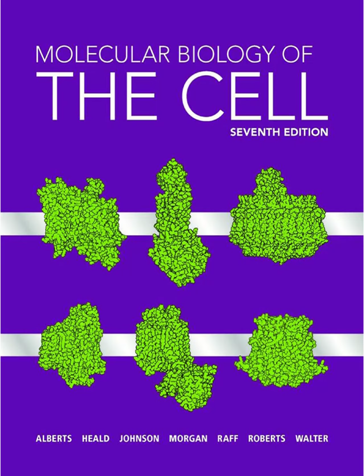And you can design these for all sorts of things. Yes. Calcium, cAMP, pH, kinase activity, even temperature. You can introduce the gene for the biosensor and watch signaling happen in real time in specific cells within a living organism. It's incredibly powerful for dissecting signaling pathways.